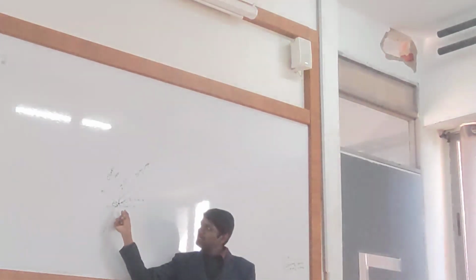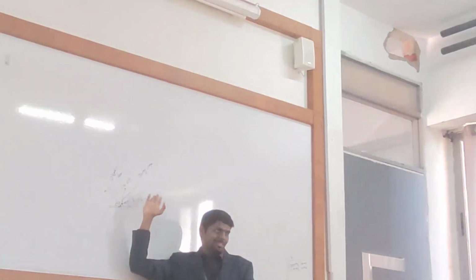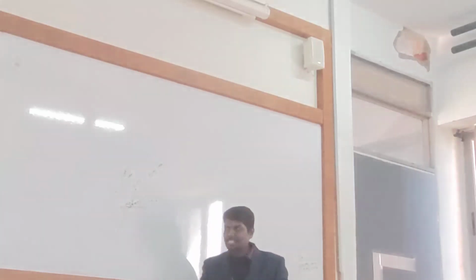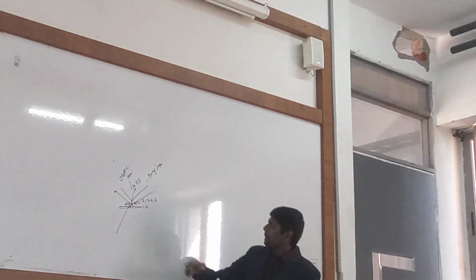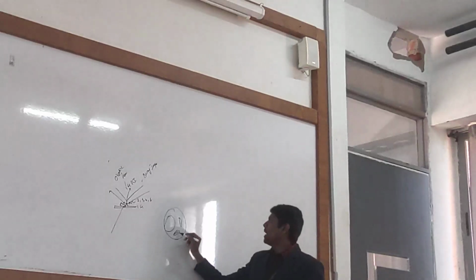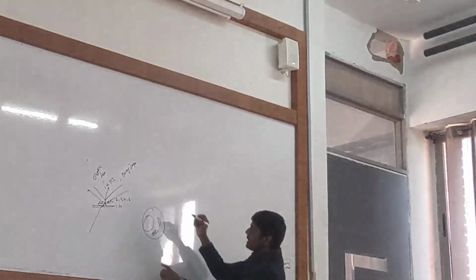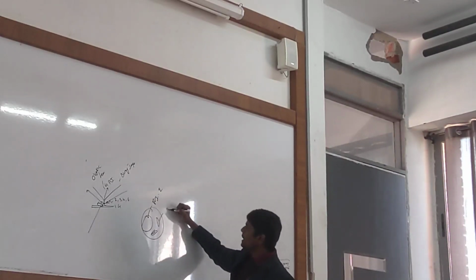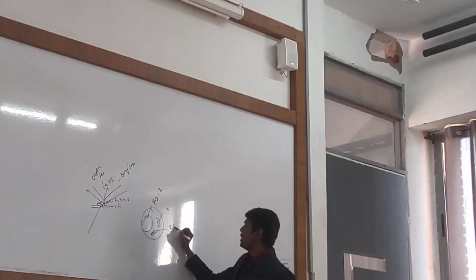Because the light on the specimen was moving here and there. It's scattered. It's refracted. Now listen. I know that this is a cell. Nucleus, ribosome, mitochondria. The nucleus has a refractive index of maybe 2. Ribosome has 3. Mitochondria has 2.5.